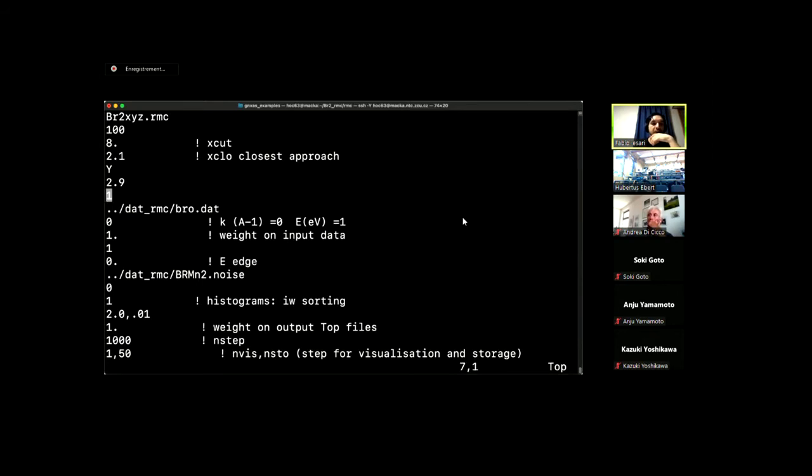Okay, then. In this file, is there the limit of displacement, that you were mentioning at some point? Yeah. So basically, every time you move an atom, it calculates the distance with the other atoms, and if it's closer than this distance, or it's greater than this distance with some other atom, the move is rejected. So it will stay inside these limits.